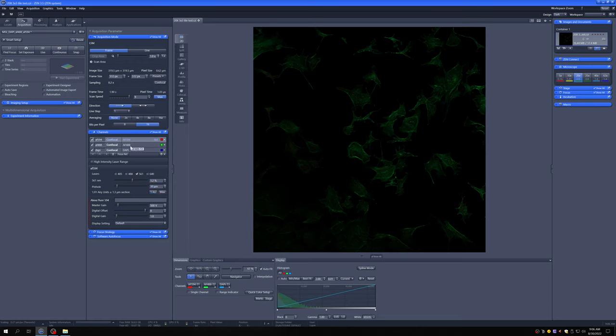If you are using a four channel setting, if you hit one AU for the longest wavelength dye, it will not usually adjust the other ones, and you need to copy this number and paste it into the other fluorophores.